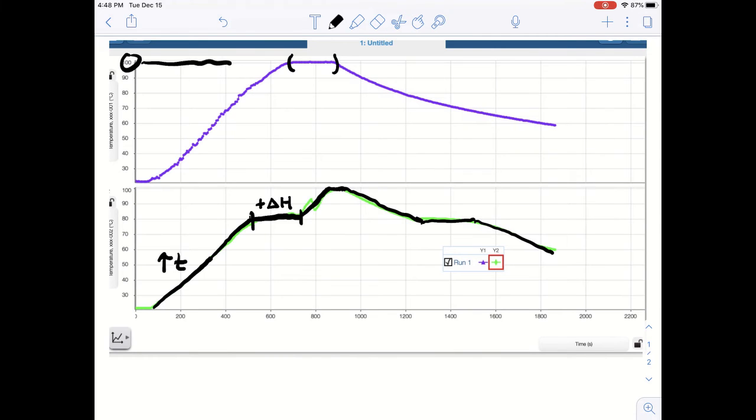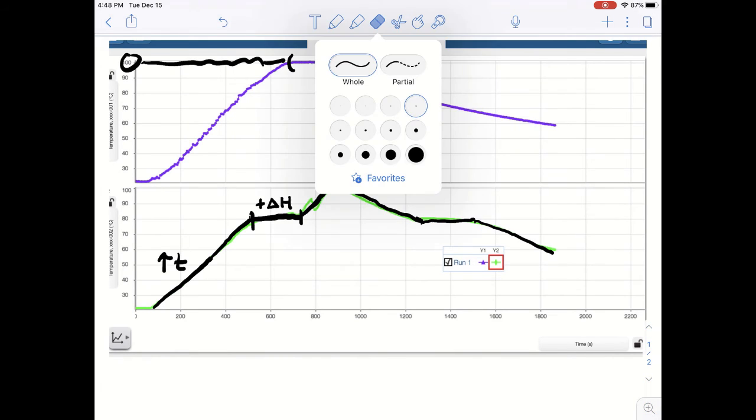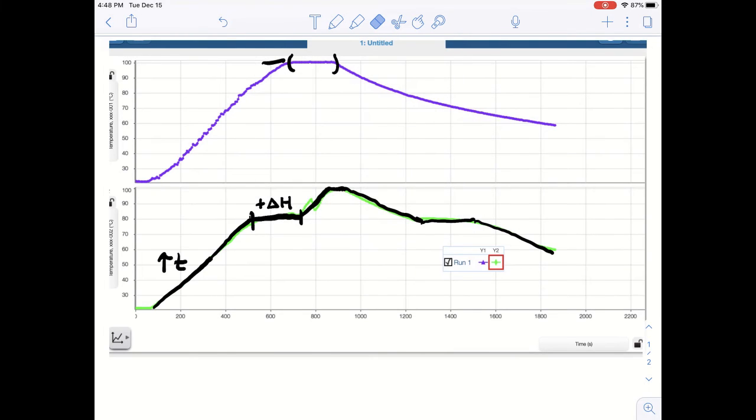So this number should be familiar to us. Roughly 100 degrees is the boiling point of water. So we see the water's temperature plateau as it begins to change state, and that means that's as hot as the unknown in the test tube can get, because the liquid water that it's submerged in is not going to get any hotter than that. Then as we take it off the hot plate, we start to decrease. So we're increasing temperature here, we're decreasing temperature here, so the particles slow down until they reach a point where they can't slow down anymore in the liquid state.